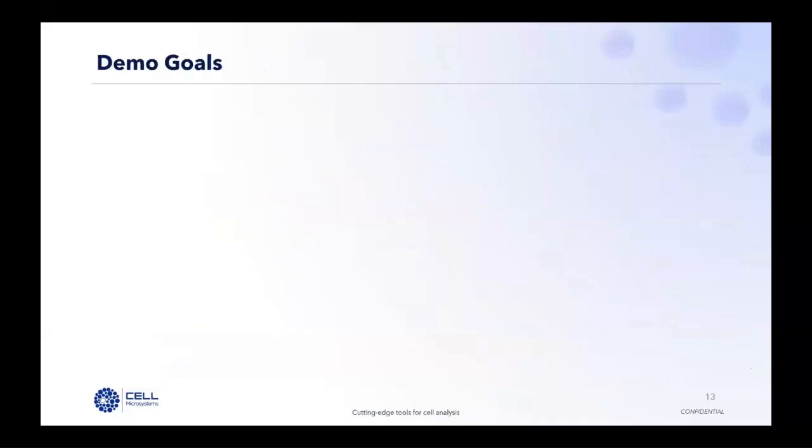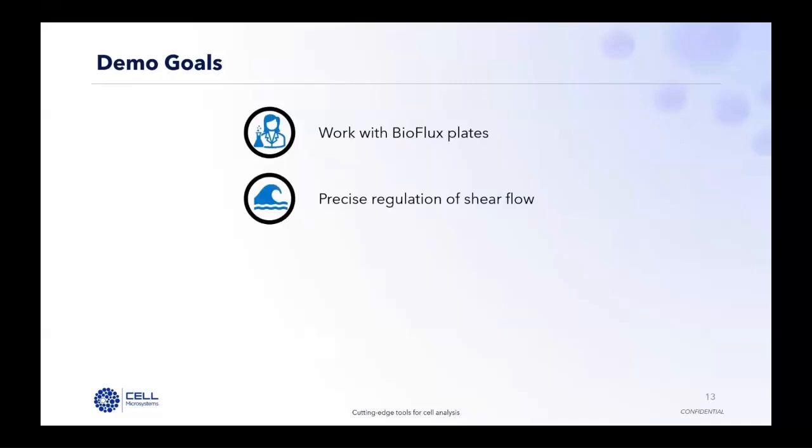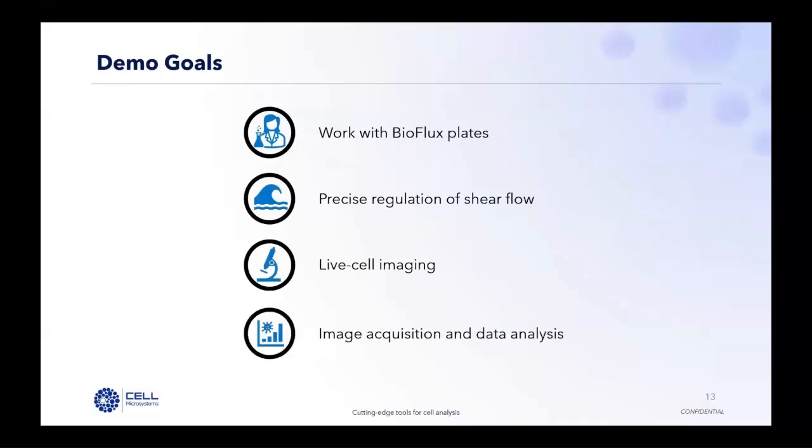Now that you're familiar with the BioFlux, let's jump into the lab where I'll show you how to work with BioFlux plates and precisely regulate shear flow delivery to experiments. I'll also show you live imaging of Jurkat cells adhering to TNF-alpha activated endothelial cells. And finally, we'll see streamlined data acquisition and analysis using Montage Plus. Let's get started.